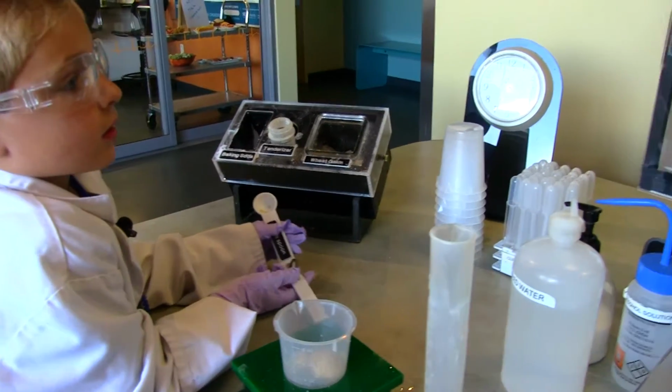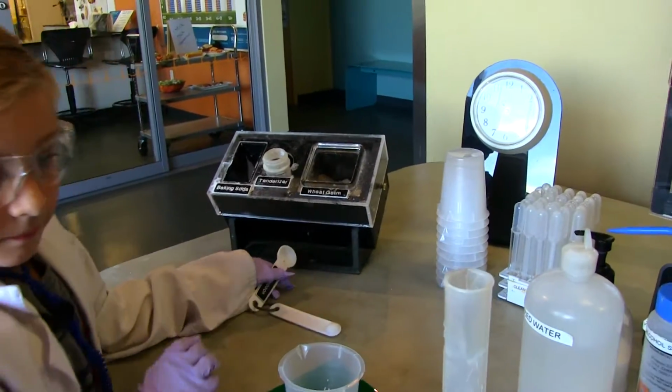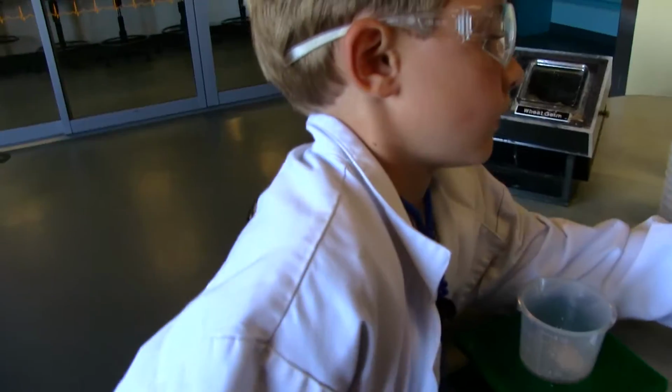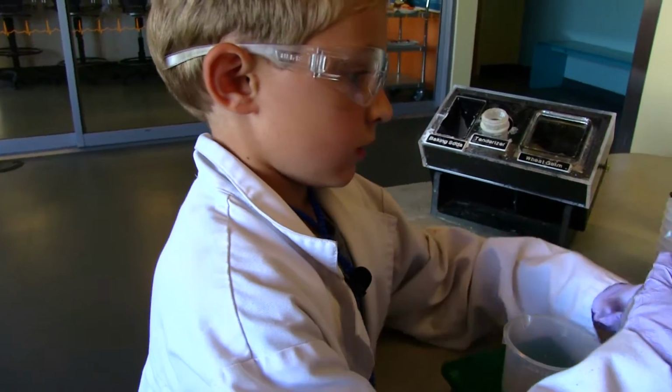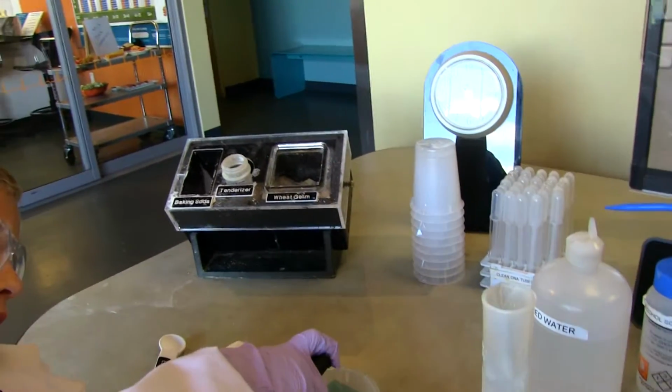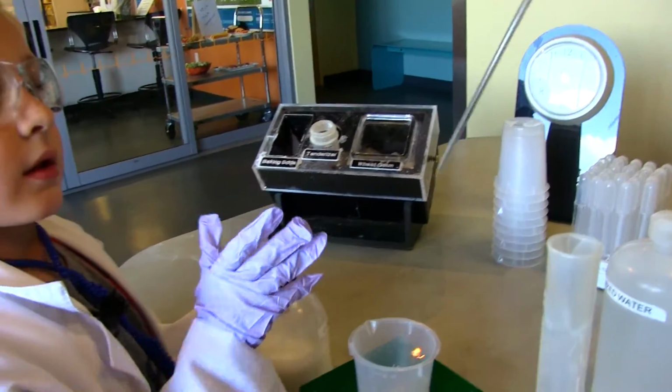Add 1 pump of liquid soap and stir for 1 minute. Where's the liquid soap? Yep. 1 pump. Good job. Okay. And stir for 1 minute.